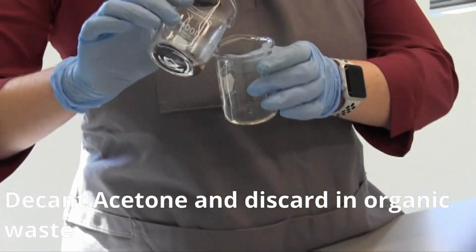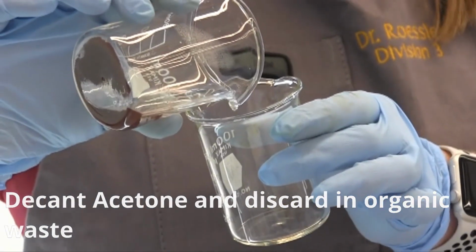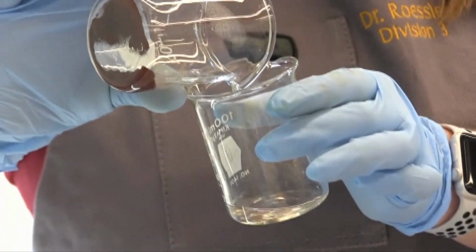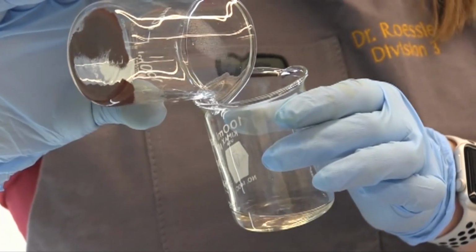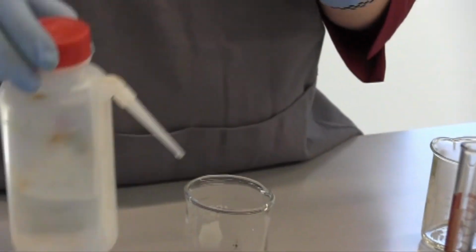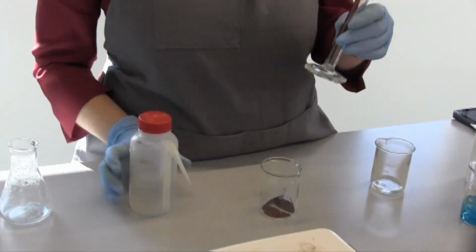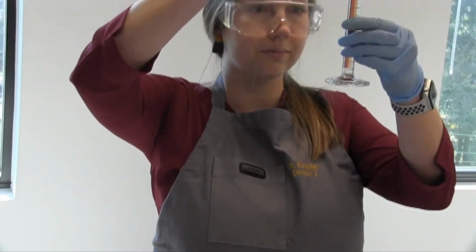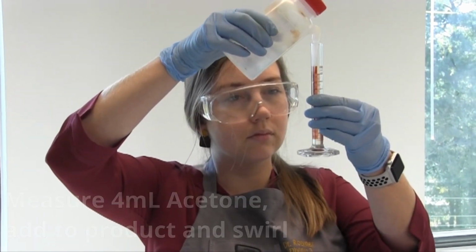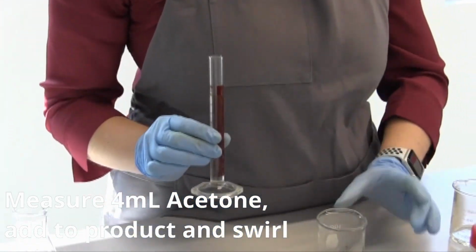Discard the acetone into a separate beaker that will be discarded into organic waste. Repeat with a second portion of acetone.